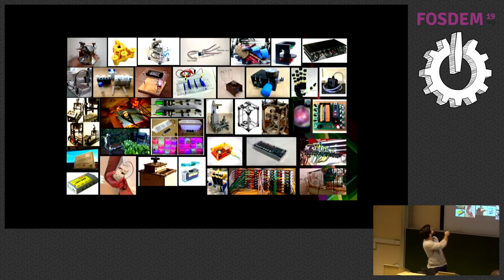This one I think is especially cool. This is an atomic force microscope. So these things are really interesting because they actually do measure like the differences in atoms at the surface of a probe and can measure like really tiny stuff. And it's pretty cool that there is an open source project for it.